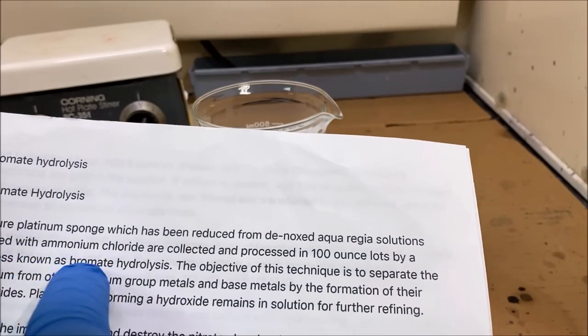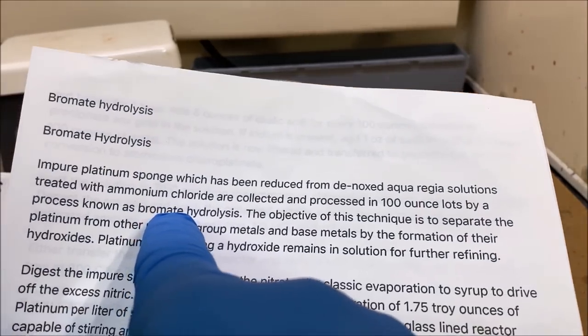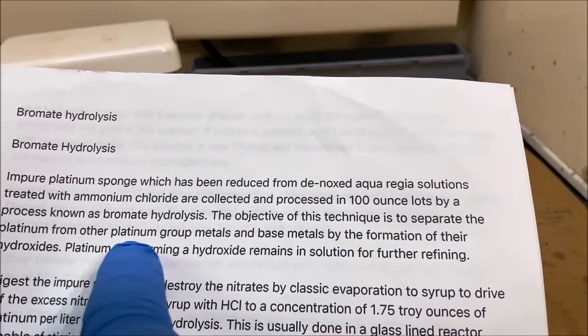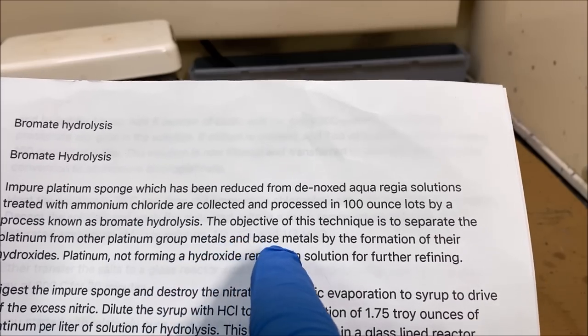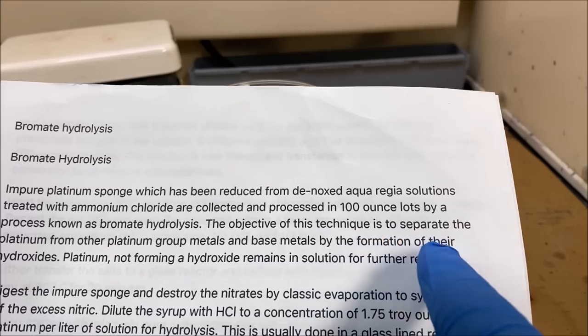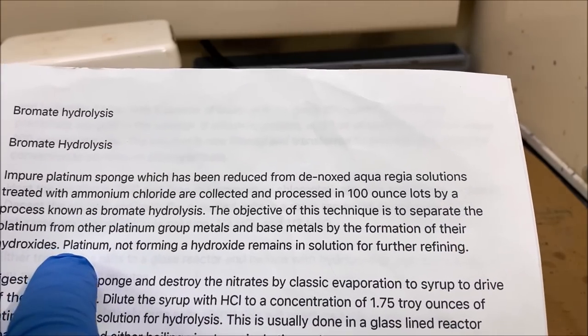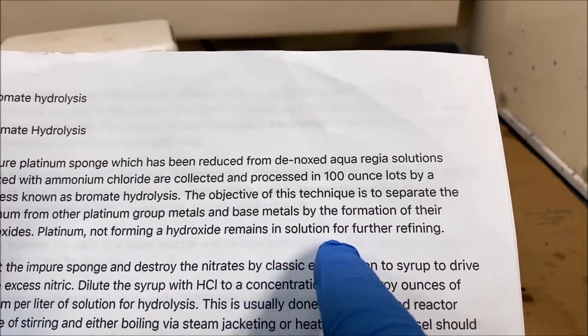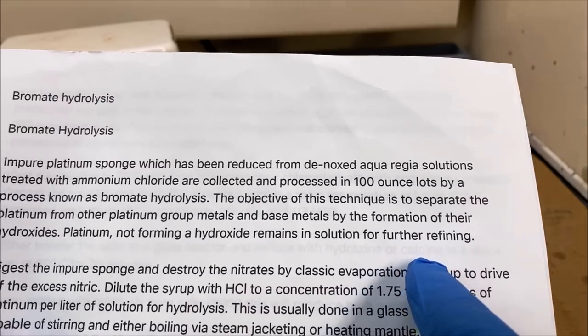And we're going to use a process known as the bromate hydrolysis. The objective of this technique is to separate the platinum from the other platinum group metals and the base metals by forming their hydroxides. Platinum, not forming a hydroxide, remains in solution for further refining.